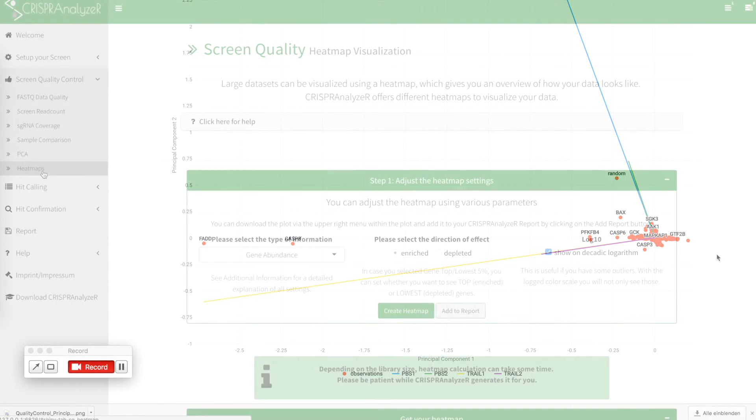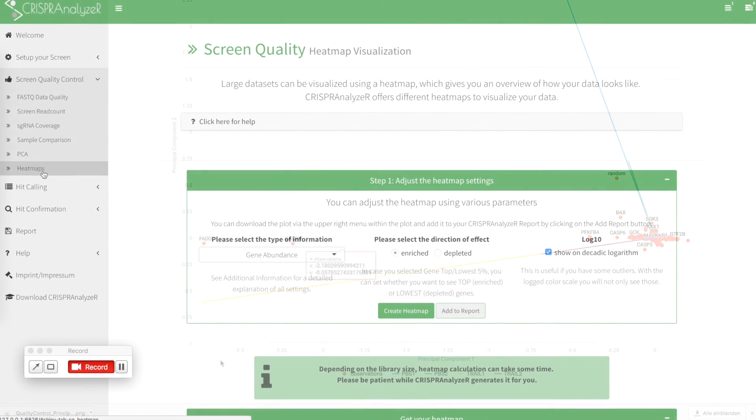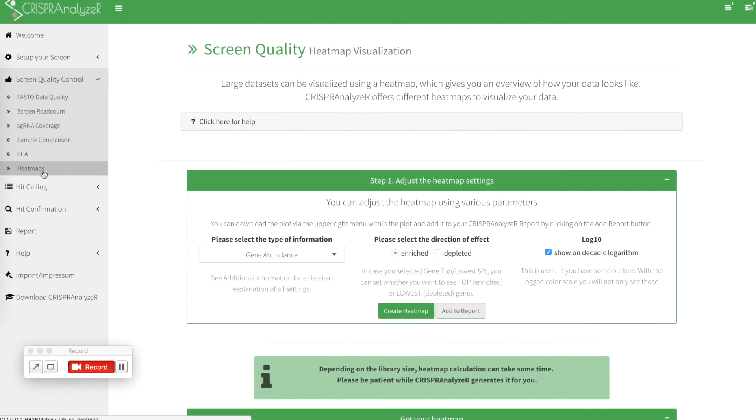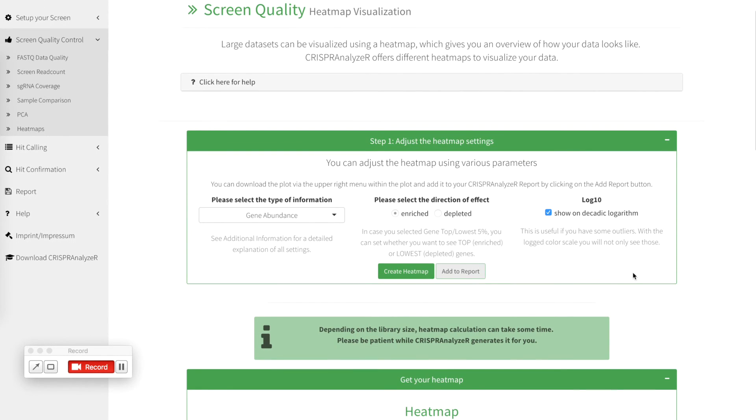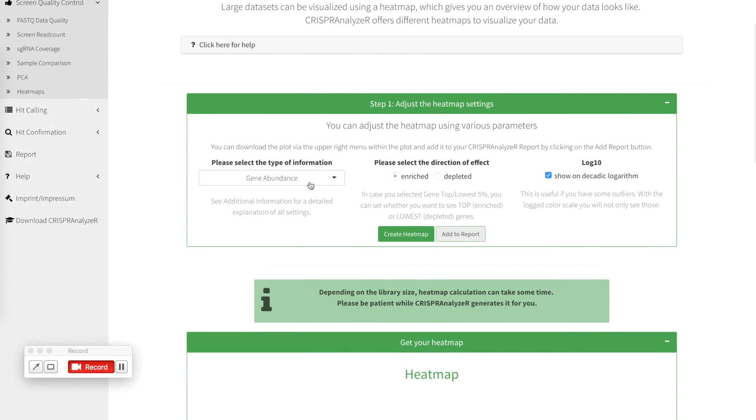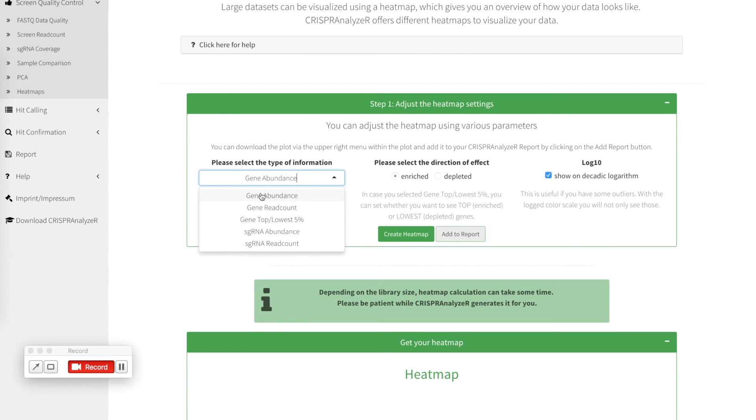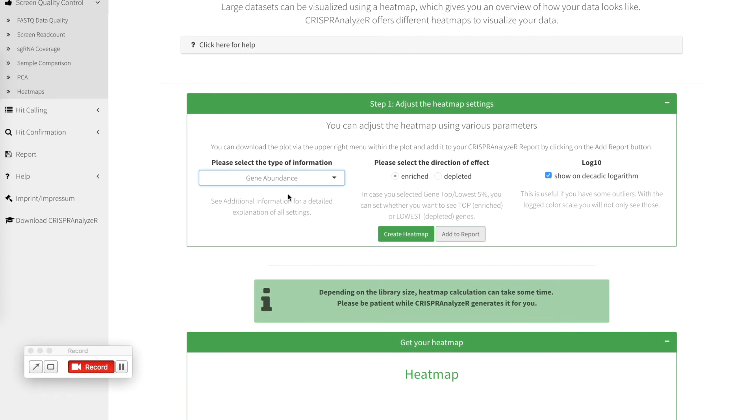As a last step in the quality control, CRISPR analyzer offers you some heatmap visualizations. By default, all heatmaps are clustered using UPGMA and you can select different type of information like gene abundance, gene read count, the top or lowest 5% of your genes as sgRNA abundance or as sgRNA read count. So let's go for a gene abundance.